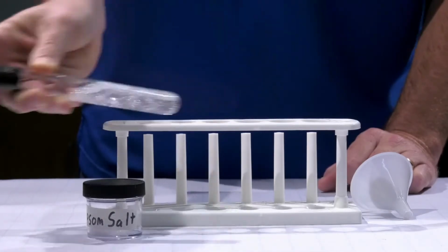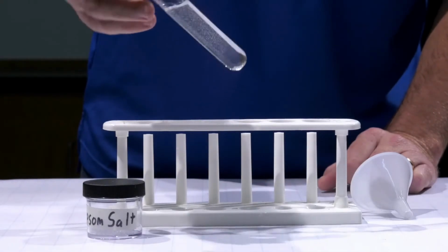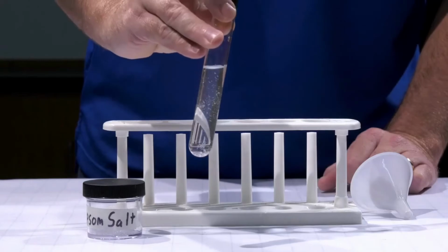So when he gets done shaking, what you want to think about is how does this look compared to the first? Is it just as clear? Is it not as clear?